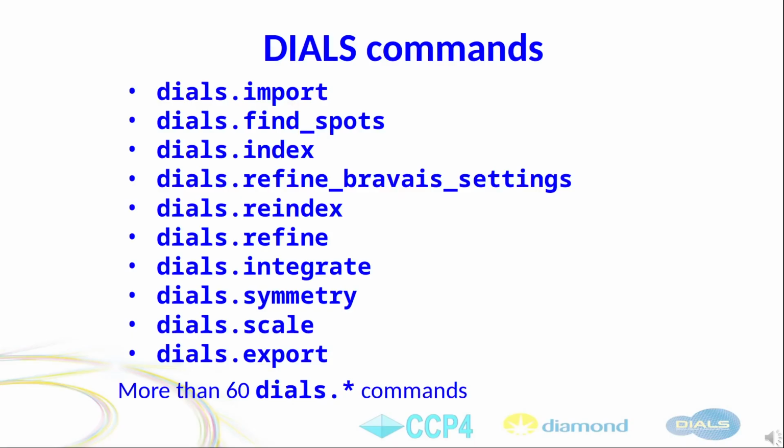If you are a user of DIALS, these are the commands that you will most frequently use. These are the most important, but there are more commands for DIALS. There are about 60 DIALS commands, some of them for processing and some of them for visualization or debugging. This way, with the command line, typing one command, reading the output and using it for the next command is the way most expert people use DIALS.